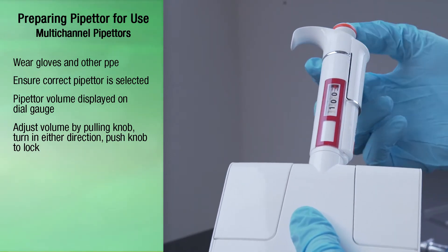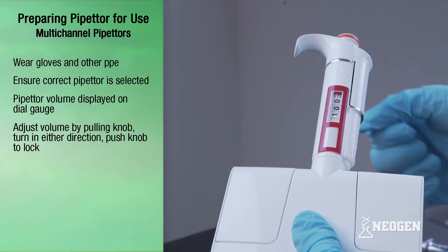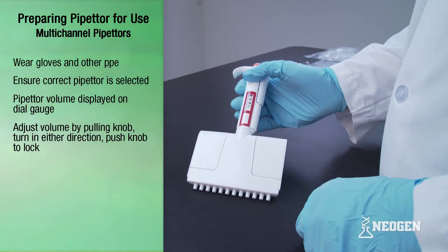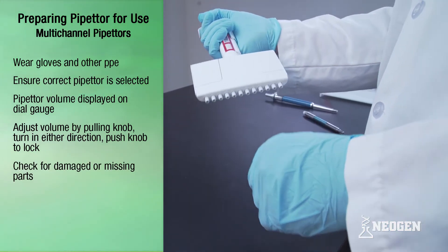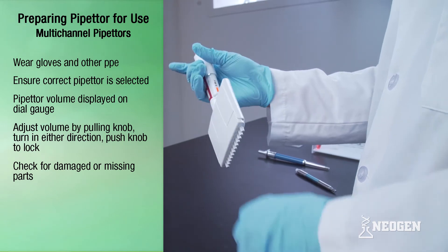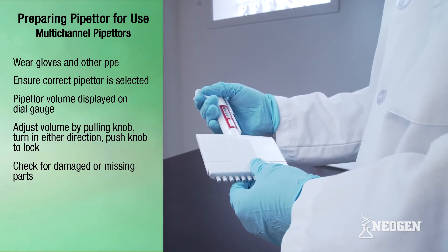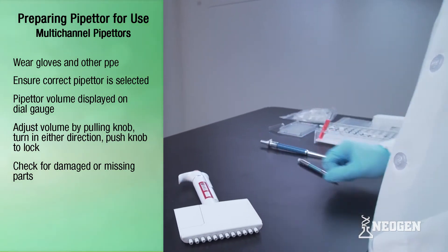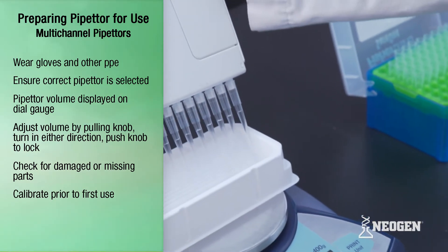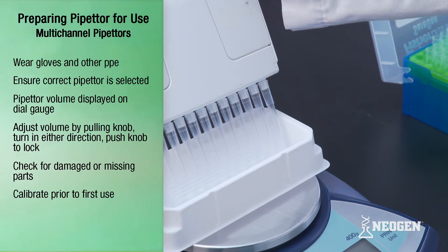Once the correct volume is selected, push the knob back to the original position to lock into place. Once the correct pipetter or volume setting is selected, the pipetter should be evaluated to ensure it should be used. If the pipetter has any missing or damaged parts, it should not be used. If a calibration program is in place and the pipetter is out of calibration, it should be calibrated before use.